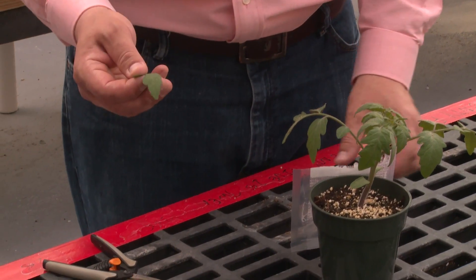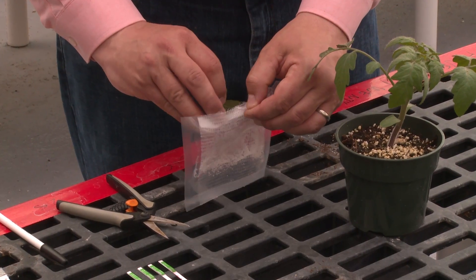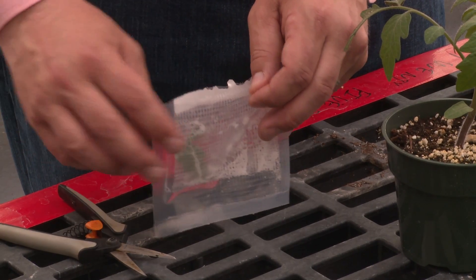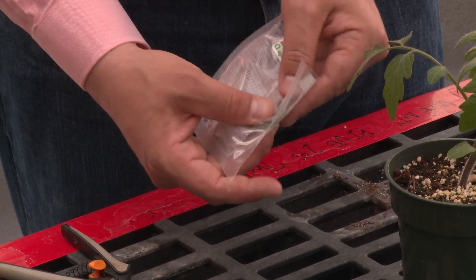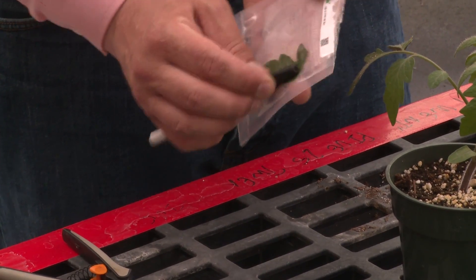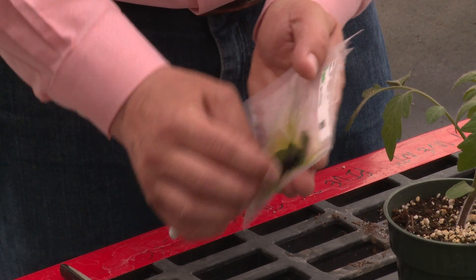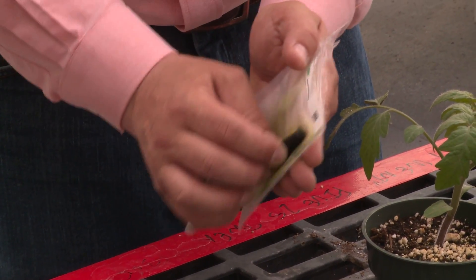Once you have your square inch of tissue, place it inside of the kit with the buffer solution. Once your leaf is inside the kit with the buffer solution, we want to go ahead and macerate the tissue. You can use something just like this pen — you want to rub it across the leaf and get that extract from the leaf into the buffer solution.